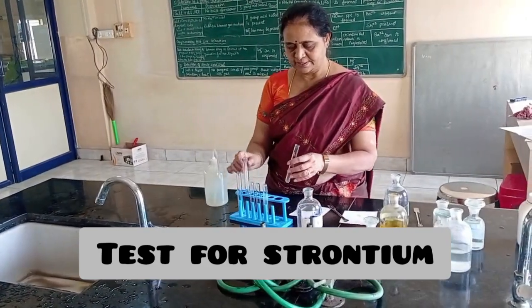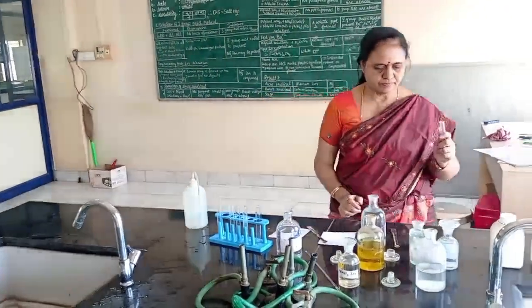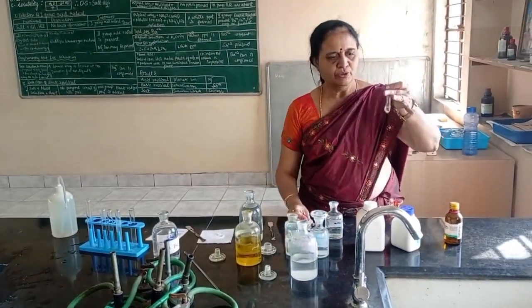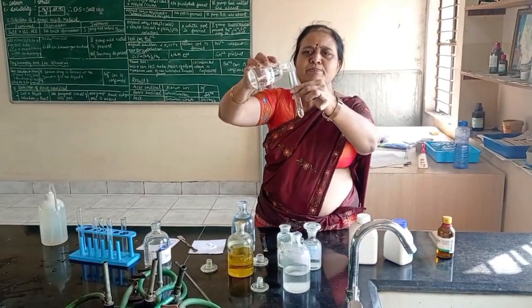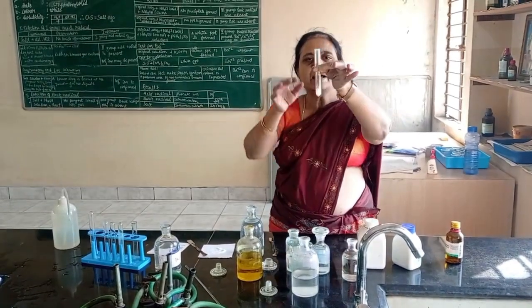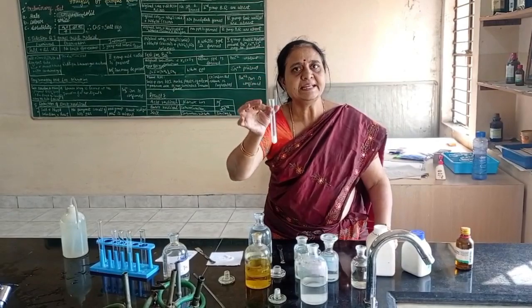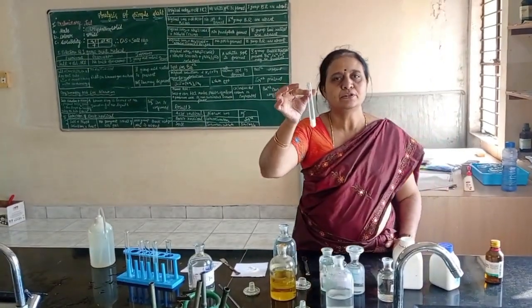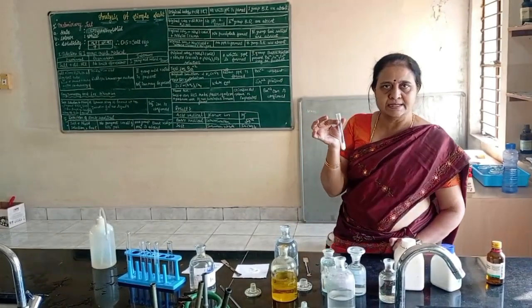Now I will check the presence of strontium. For this, I am taking original solution and adding ammonium sulfate. See here, original solution plus ammonium sulfate, I am getting white precipitate. Formation of white precipitate indicates that the fifth group basic radical is Sr2+ strontium ion. The given basic radical is strontium ion.